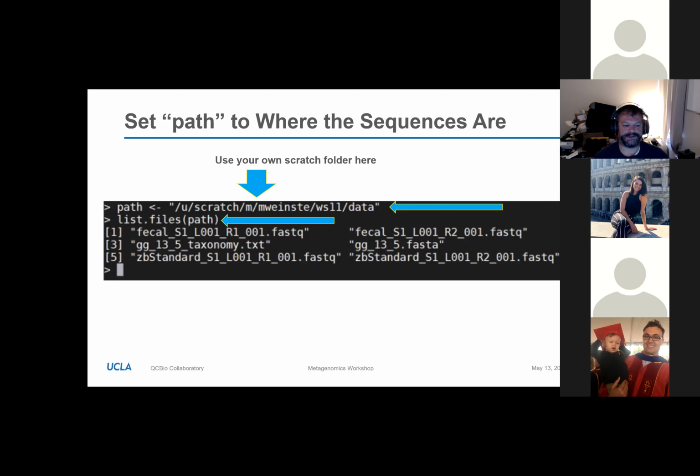And then the ZB standard, that's the one I mentioned earlier. There's only one Zymo microbiome product that I'm specifically going to mention, and that is ZB standard, which is the Zymo community standard. The reason for that is that's actually the data source for this one.